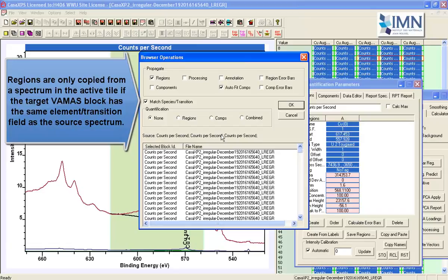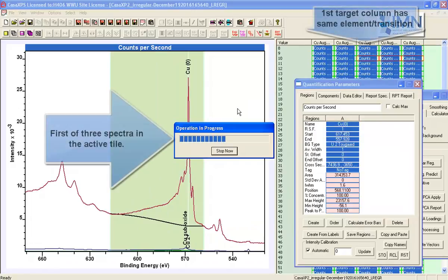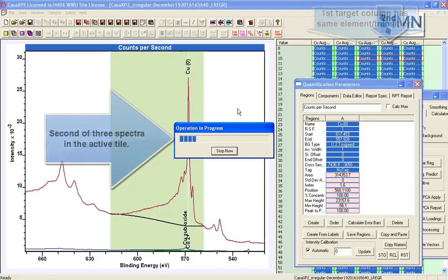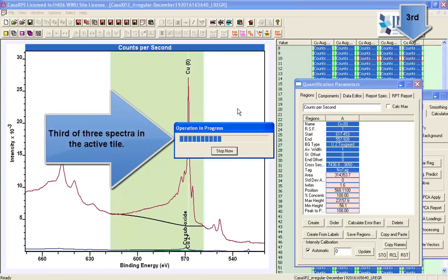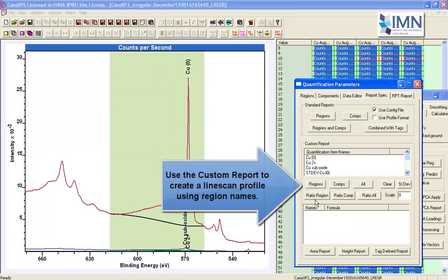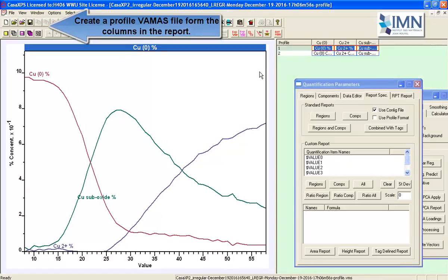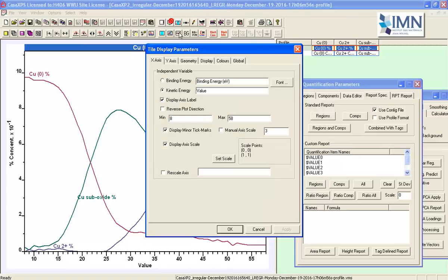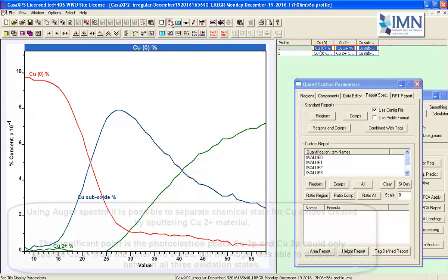We propagate the regions to all three columns of basis functions. We overlay the spectra with regions in the active tile, then use propagate-and-match so that the appropriate region is passed to the appropriate column. Having done that, we create a profile table and then the profile itself. It is now clear that we have been able to differentiate nicely between the metallic form, the suboxide, and the copper(II) oxide.